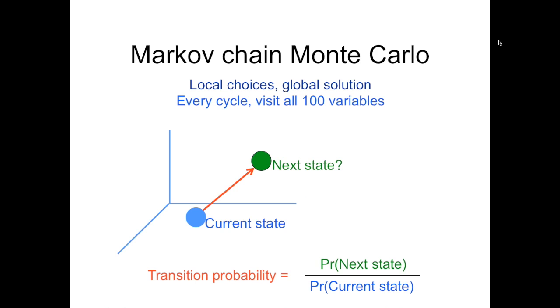In order to explore all these variables, we need a search method. Ordinary calculus and integration doesn't work because there's more than 2 or 3 variables here. I've already described, if you look at all the hierarchical levels, the way one mixture weight parameter is now customized to maybe 15 different loci. There are many, many variables if you account for hierarchy. And so Markov chain Monte Carlo is the standard method for solving these problems.